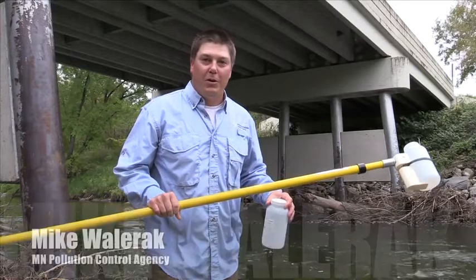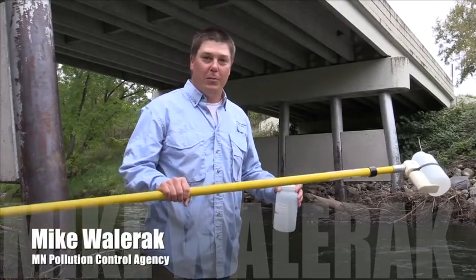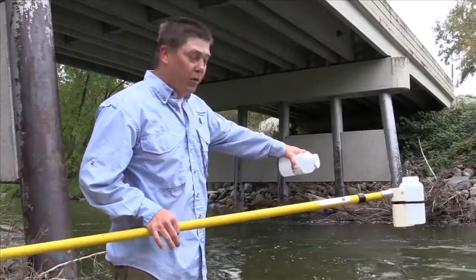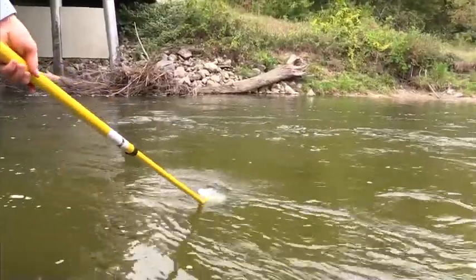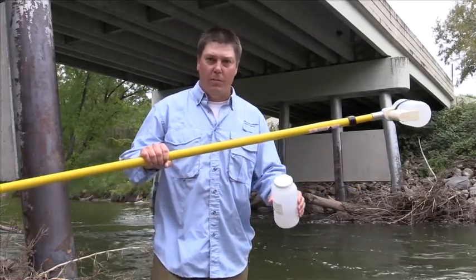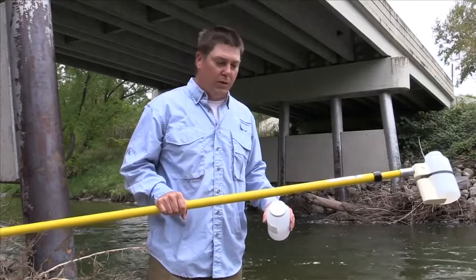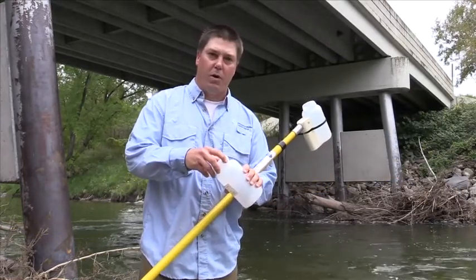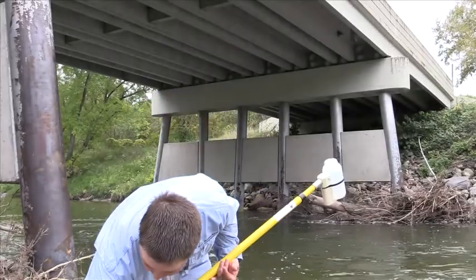I'm down here at the water's edge right now and I'm going to be taking a sample using the telescoping rod. It's important that you find an area where you can reach good flow with your rod. You want to make sure when you come down that you bring all your equipment that you're going to need to take the water sample. Once you're down here, you want to gently loosen up the cap to the water bottle and just have it ready.